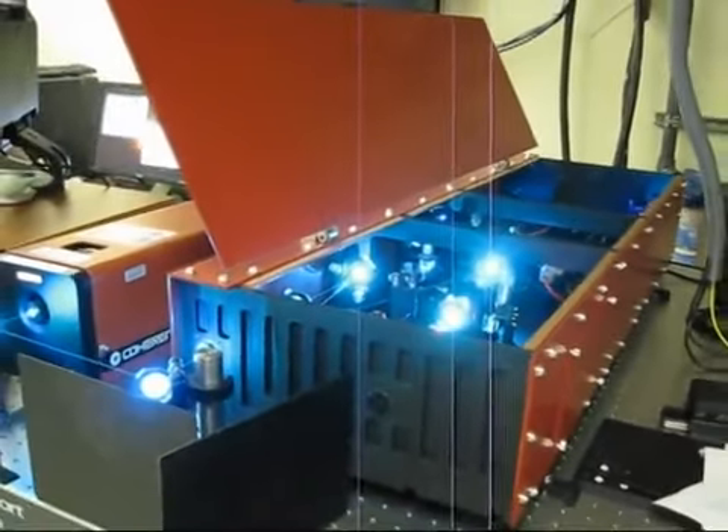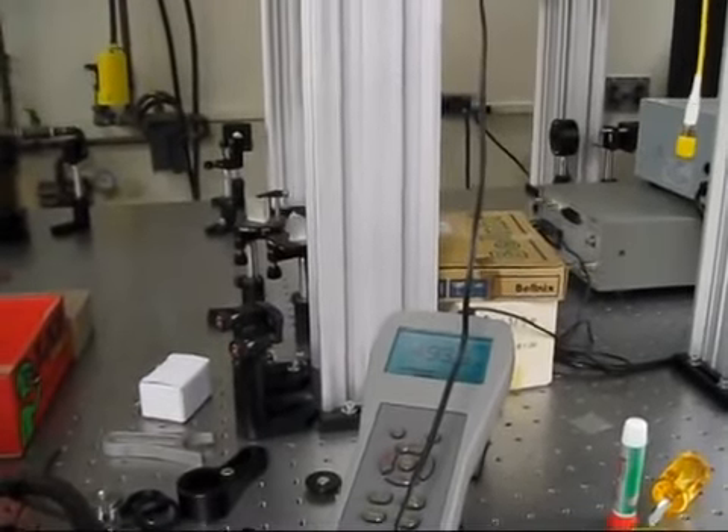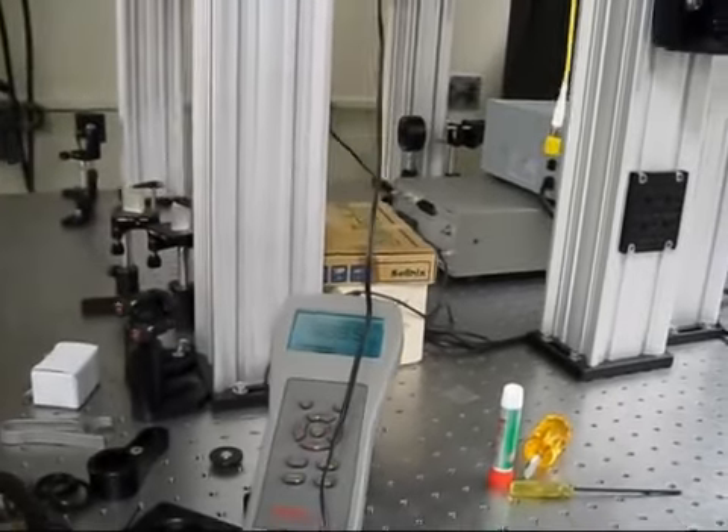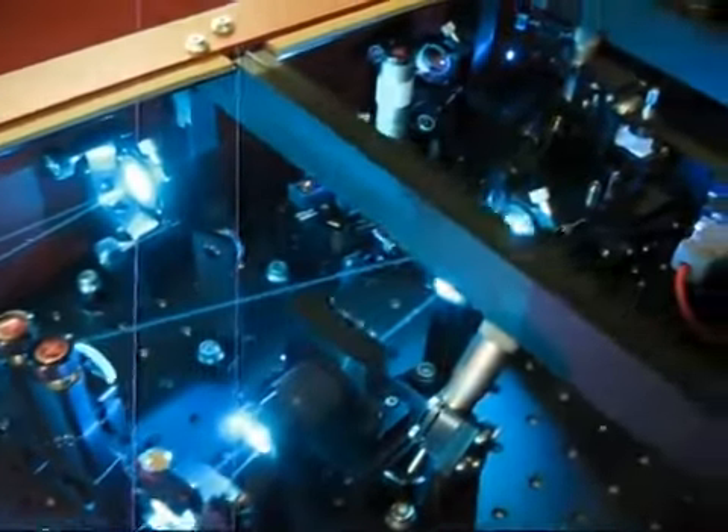We get an output at around... The pump power is around probably six or seven watts. A low-cost ultrafast oscillator is something very unique — at a price of tens of thousands of dollars, an order of magnitude less than the commercial offering from Spectra-Physics or Coherent. One can start multiphoton microscopy right away in a tabletop lab without having to use a core facility or expensive confocal scanning units from microscope manufacturers.